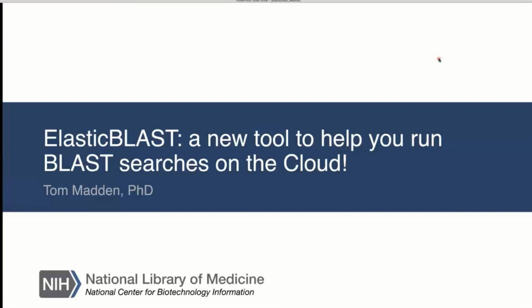Hi, this is Tom Madden. I'm the lead for BLAST at the NCBI. Today I'm going to tell you about a project I'm really excited about. It's called ElasticBLAST, and it lets you run your BLAST searches with minimal effort on the cloud. My main emphasis today will be on what ElasticBLAST can do for you. This is not supposed to be a tutorial on how to run it. We have pretty good documentation on that, and I'll point you to that documentation at the end of the webinar.